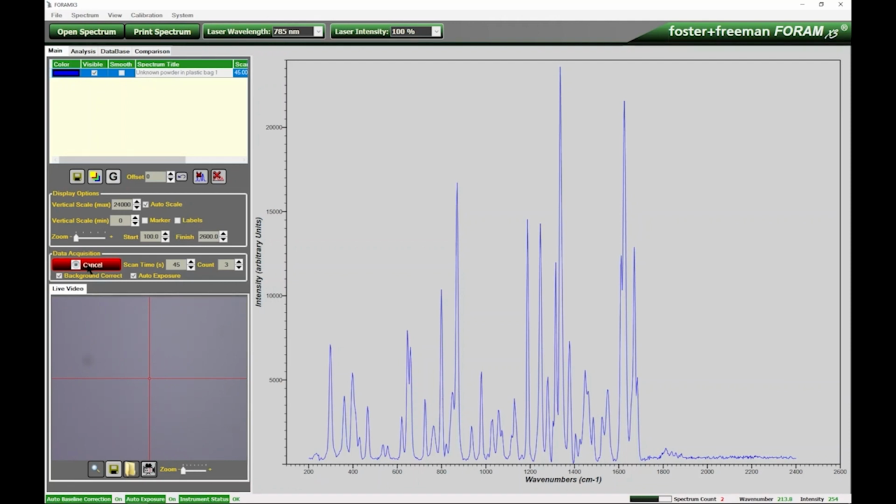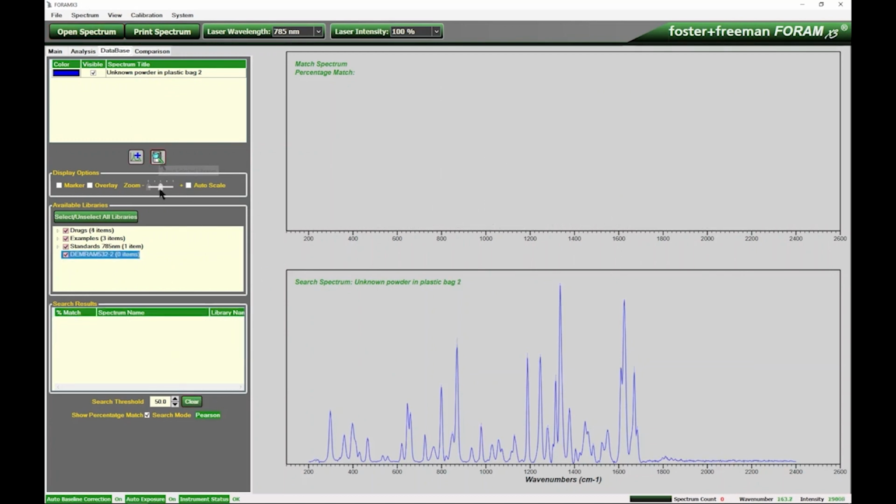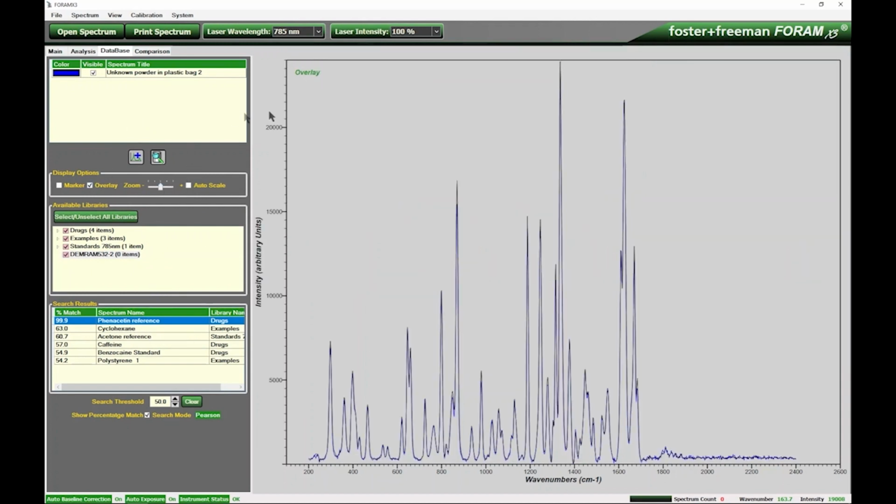This may be especially important for some drugs that are highly potent at low levels, drugs such as fentanyl, some of the psychedelic phenethylamines, where minimizing exposure to the examiner would be highly beneficial.